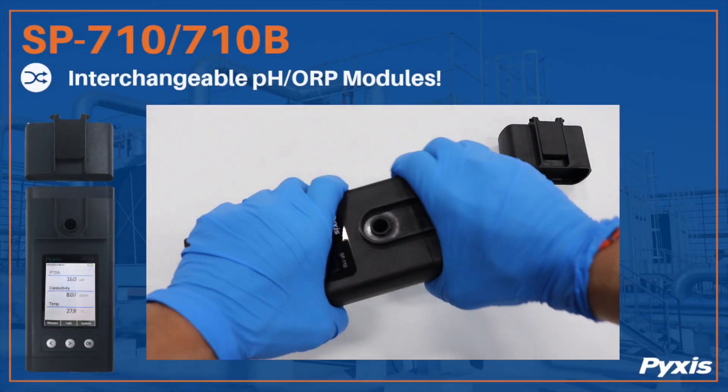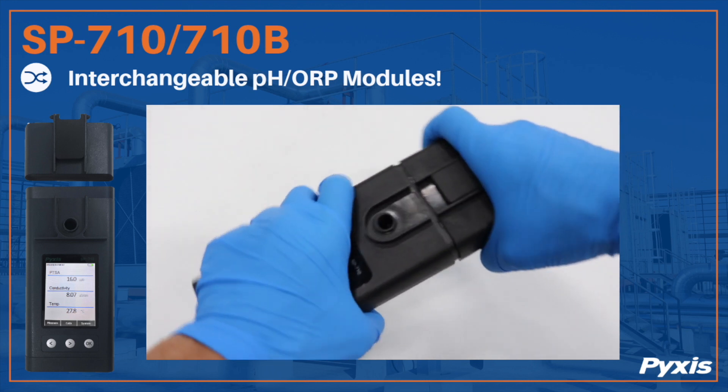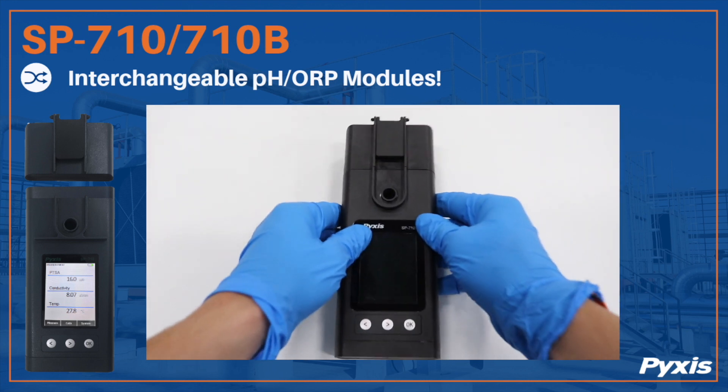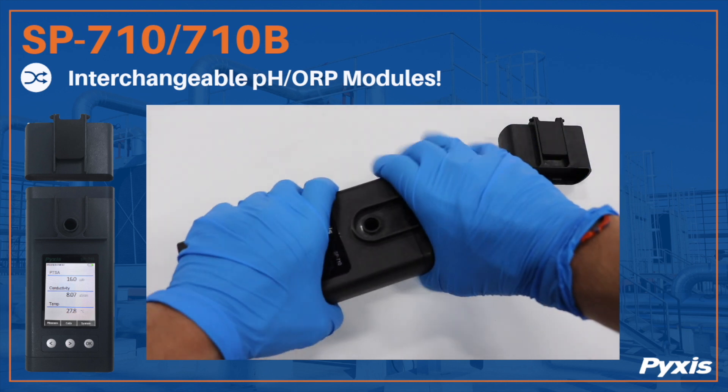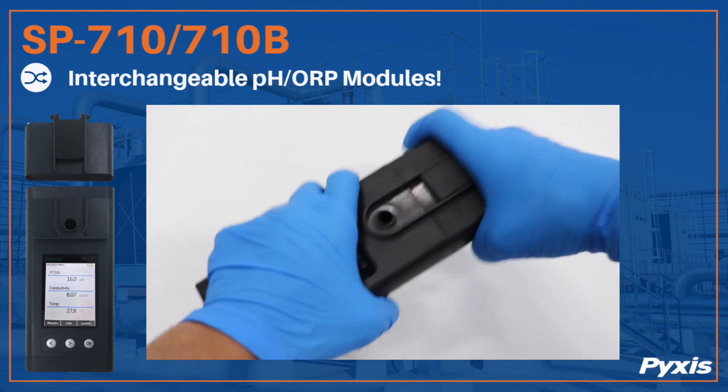The battery-operated pH/ORP module is easily replaceable through our snap-on and wireless design and requires no disassembly in the field for replacement. The module is 100% waterproof, epoxy-potted, and wireless, communicating with the base device via Bluetooth.